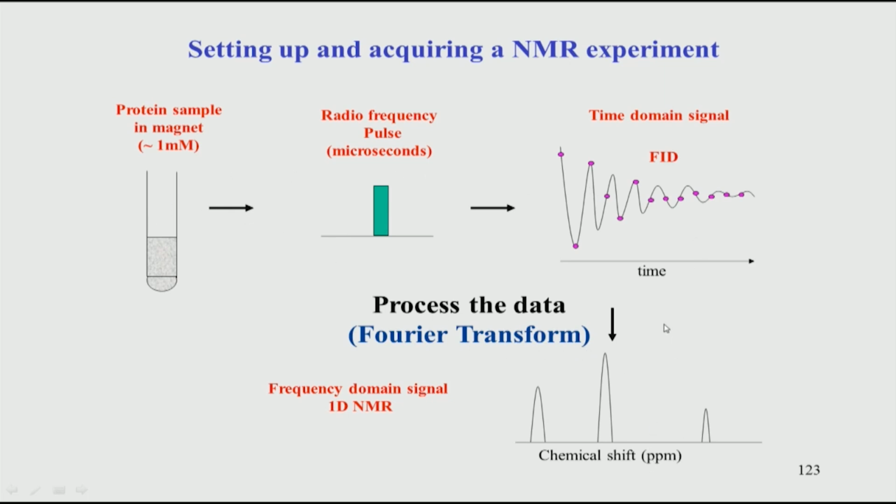In the next class we will look at how we record this data experimentally. Although we have already seen what the hardware looks like, we will cover the practical aspects of recording a spectrum, and then how we interpret the NMR spectrum.